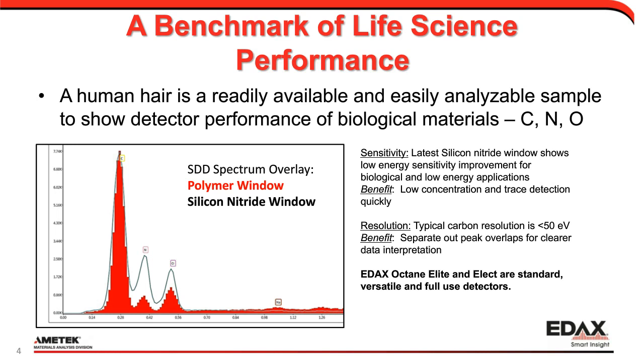And also equally important in spectral analysis is we like to see the peaks go back down to the baseline, or as far down to the baseline as we can. And that gives us our nice ability to separate those peaks. So there is a tie-in between sensitivity and resolution, because the better that we're able to pull the peak above the background with better sensitivity, the better we're able to separate it from the neighboring elements. Likewise, on the flip side, the better resolution that we have, the fewer channels it bins the signal into, and that gives us the ability to get better sensitivity just simply by nature of binning the X-ray into the proper channels where it belongs.